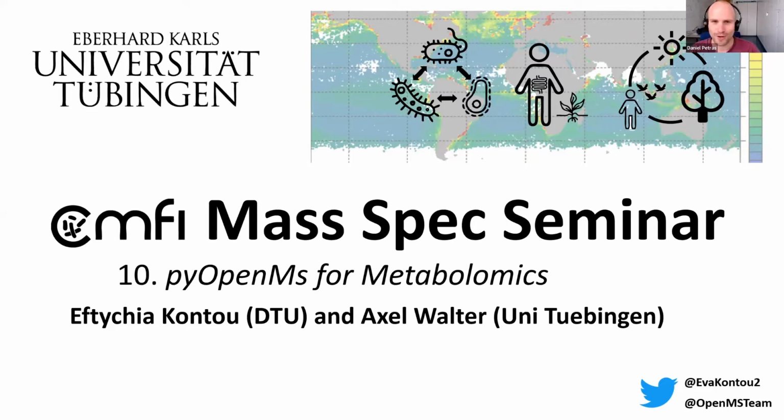It's a super great pleasure to have today Efi and Axel here giving the lecture on pyOpenMS, and basically all in the realm of building a data analysis workflow that fits in a Python script or in a Jupyter notebook, which I think is quite useful when you're at the more advanced stage of metabolomics data analysis and you want to build something that you can use for routine analysis.